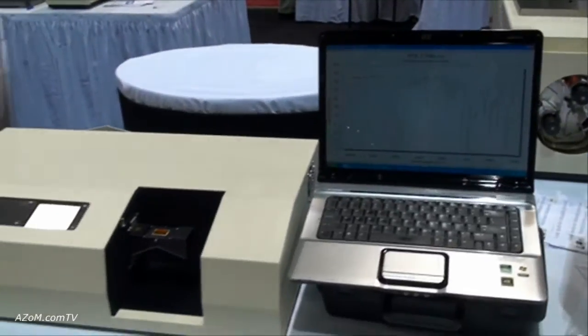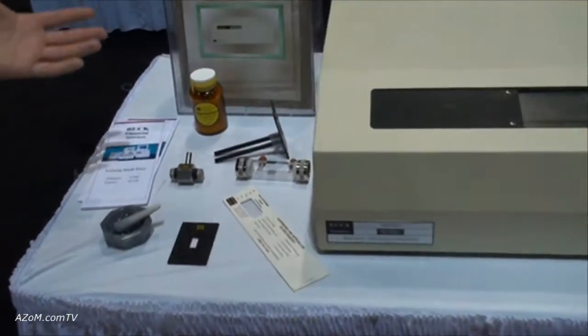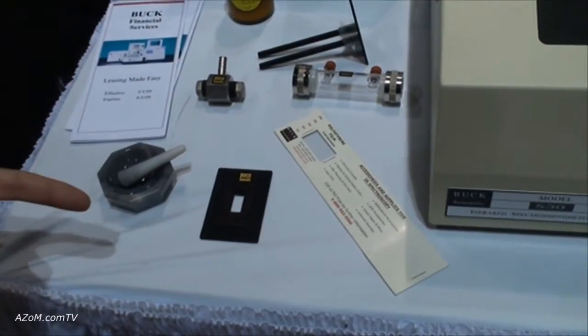We can also upgrade the software for additional features like smoothing and library searching. And our infrared spectrophotometer works with many of the same sampling components that an FTIR does. So over here we can still run KBr pellets, gas cells. This is our thin film holder for plastics.